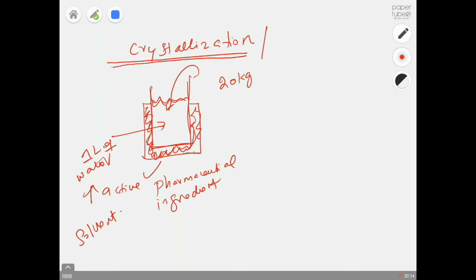and then just assume we have some UV spectrophotometer here, so that allows you to monitor your concentration expressed in terms of grams per liter. So what we are going to do is plot the temperature expressed in degrees centigrade versus your solubility concentration.